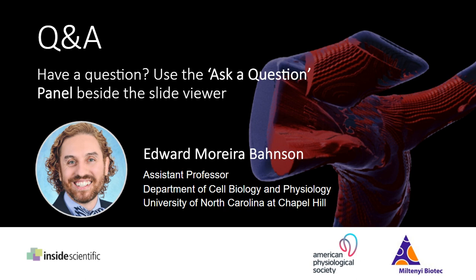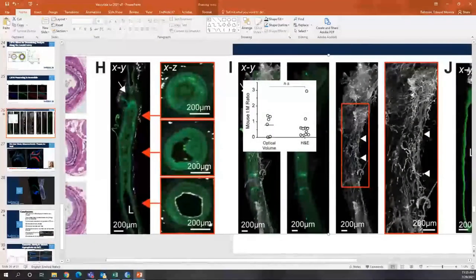Great answer. All right, next question here about the technology. How small of a vessel were you able to image in 3D? Did you try any peripheral vessels? That's a great question too. You see my mouse hovering. These are capillaries in neovascularization, and this is angiogenesis in a mouse.